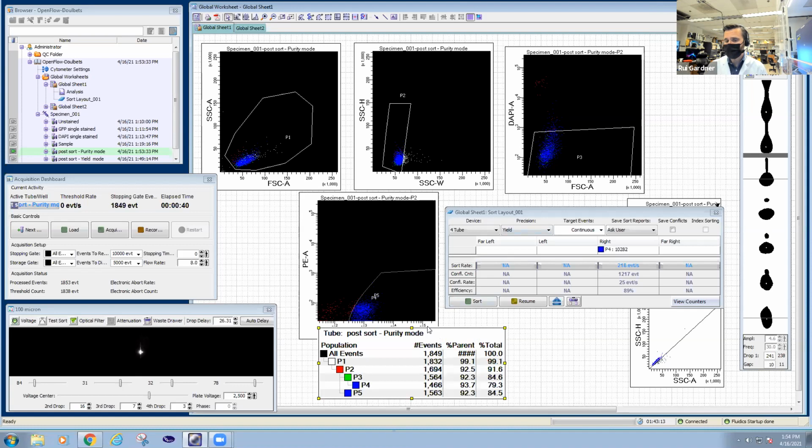And that's one of the reasons why it's a nice idea to add the viability dye in your post-sort sample, because it helps you to determine whether some of the events may have been positive events, but there are cells that just died, and so end up skewing a bit the purity. And I think you're going to talk a little bit about that, right, Derek? But what we need to compare really is this percentage, right? 93.7% with the same gates. Oh, and I should say that when I recorded these, I recorded exactly at the same flow rate that I recorded the original sample.